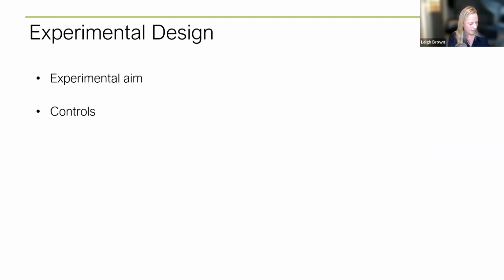Oops, sorry. The other main thing that you need to consider with your experimental design, and there are lots of things here, but I do want to talk about controls. So you need your controls. Here's just another random gene expression study. This is maybe a researcher looking at the expression of a particular gene after some treatment in mice, right?